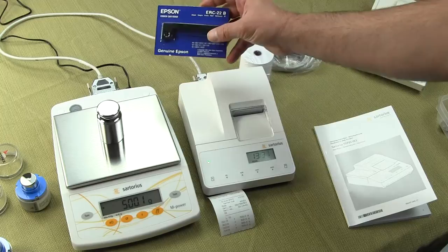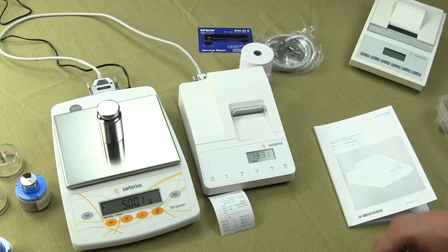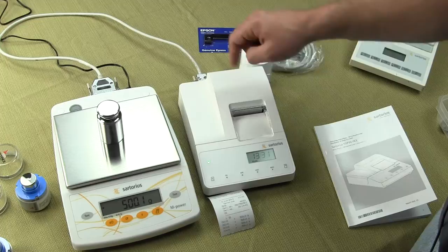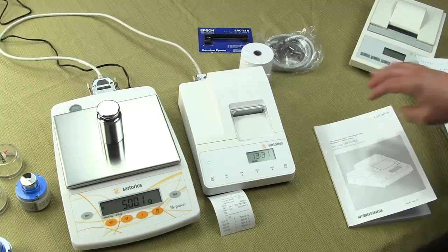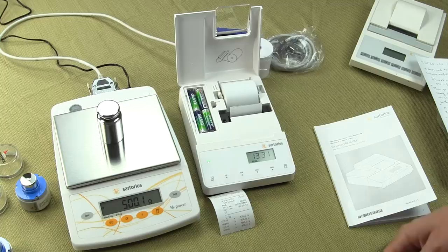The printer also comes with one ribbon cable. This printer is not a thermal printer. A lot of printers in the laboratory industry are thermal printers, and we'll discuss in a few minutes the benefits of going with an impact printer. The printer is also powered by the balance itself — there's a power line going through the printer cable — and there are four rechargeable batteries that go right here.